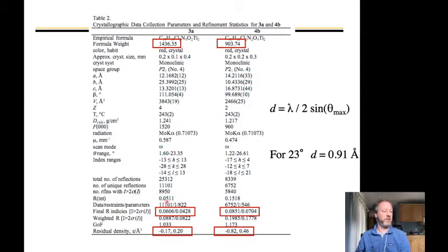And this R factor is probably the most important factor when I'm looking at a small molecule. This is like a best least squares line fitting R factor, right? So 0.05, a 5% structure is a very good structure. A 15% structure isn't great, but obviously it got published. And then, sorry, that's R internal, totally lying.